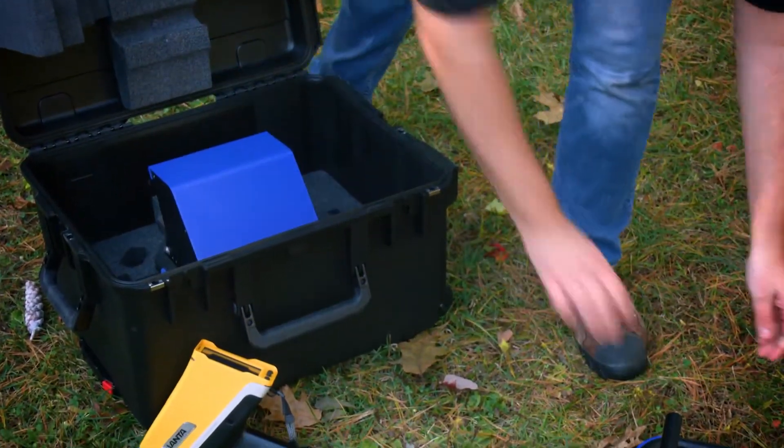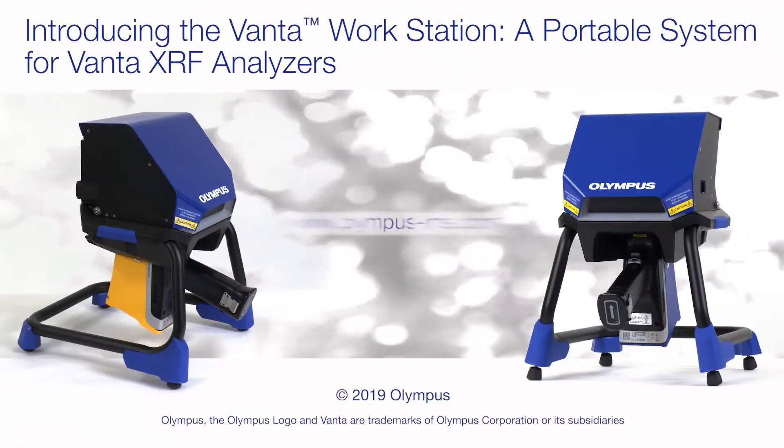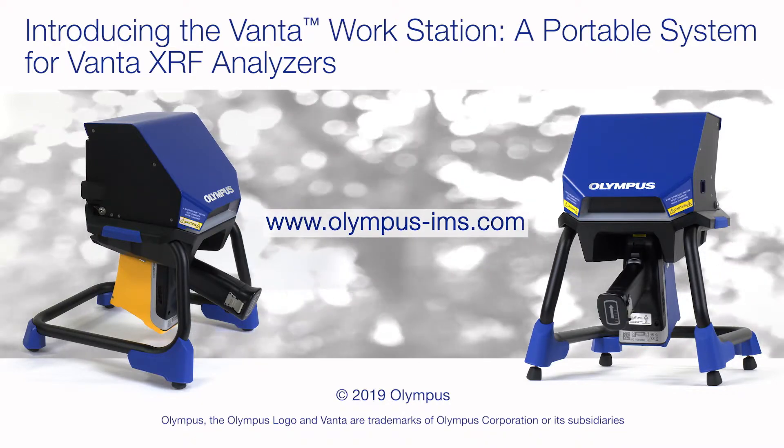An optional carrying case keeps your workstation secure. To learn more about Vanta XRF analyzers and the Vanta workstation, visit olympus-ims.com.